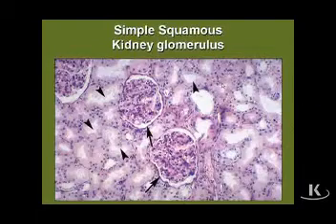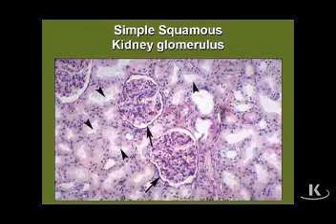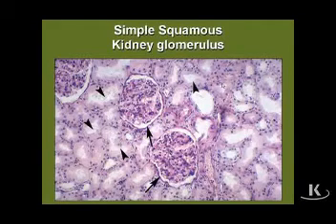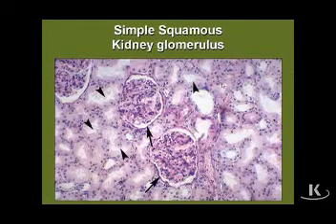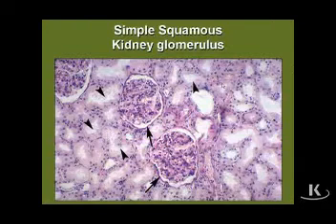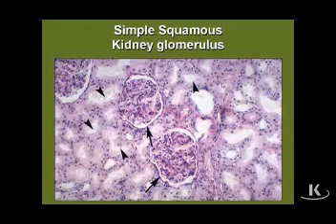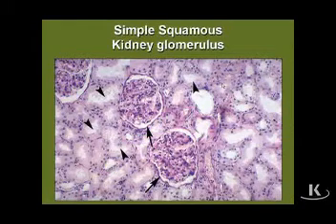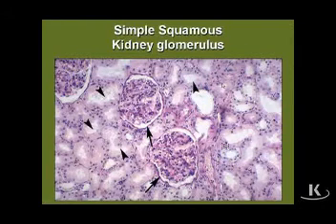Moving from simple columnar to simple squamous epithelium: simple squamous epithelium is highly characteristic of the endothelial cells that line all blood vessels, but it also forms the parietal layer of the kidney glomerulus, as indicated by the arrow. At the arrowheads are proximal tubules that again contain a simple cuboidal epithelium characterized by numerous microvilli.